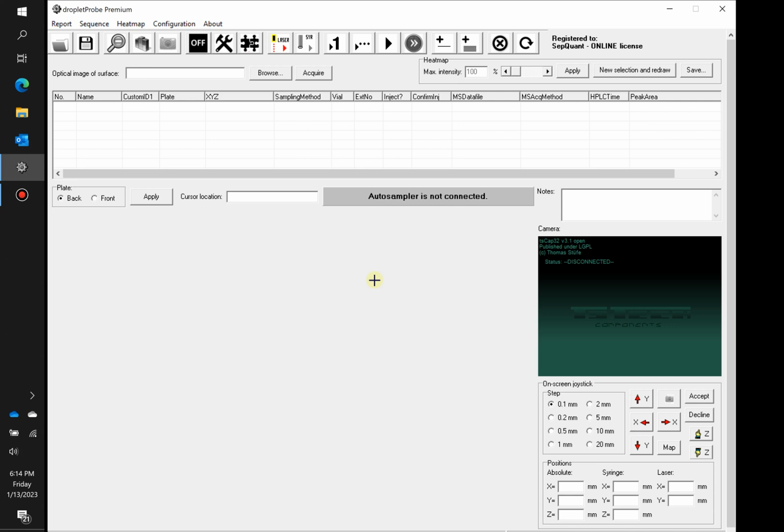This heat map is not anything that's required for the workflow, but it's nice to present to colleagues with a visual representation of your work, and it's just not required. So I'm going to leave that for later on. It is also in the manual. But the use of the software is just kind of nice to get a video tutorial of.